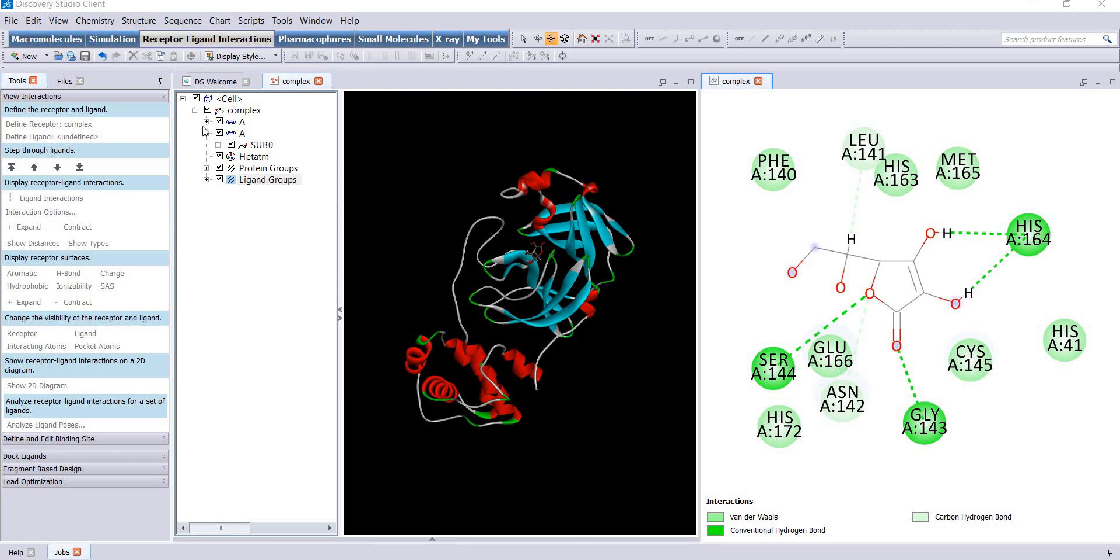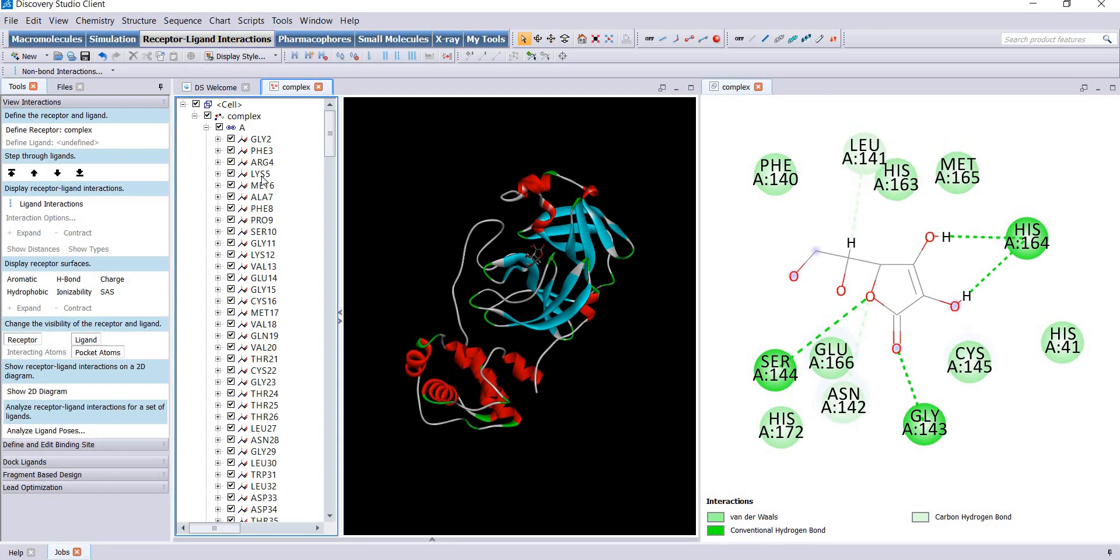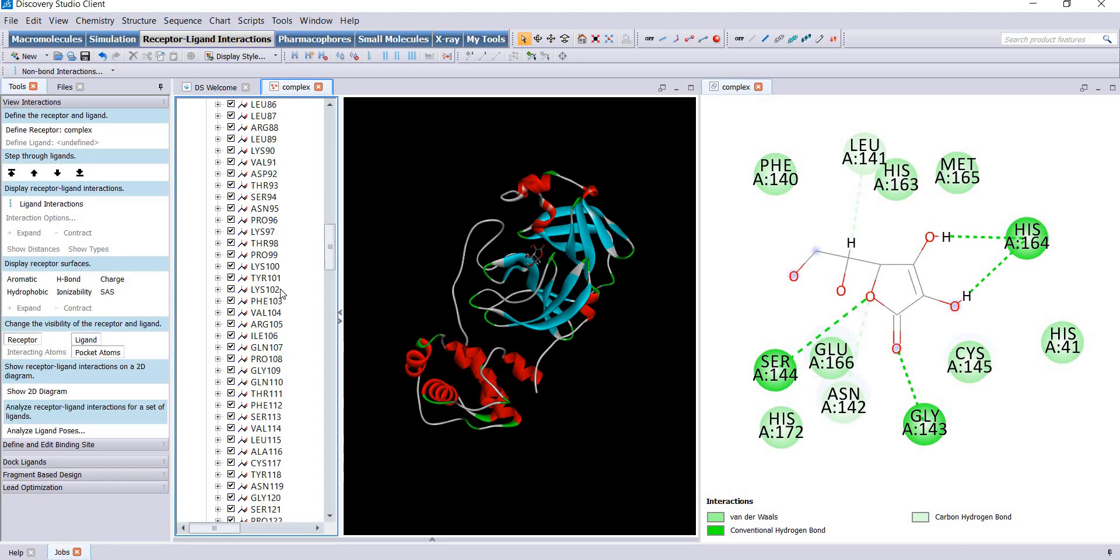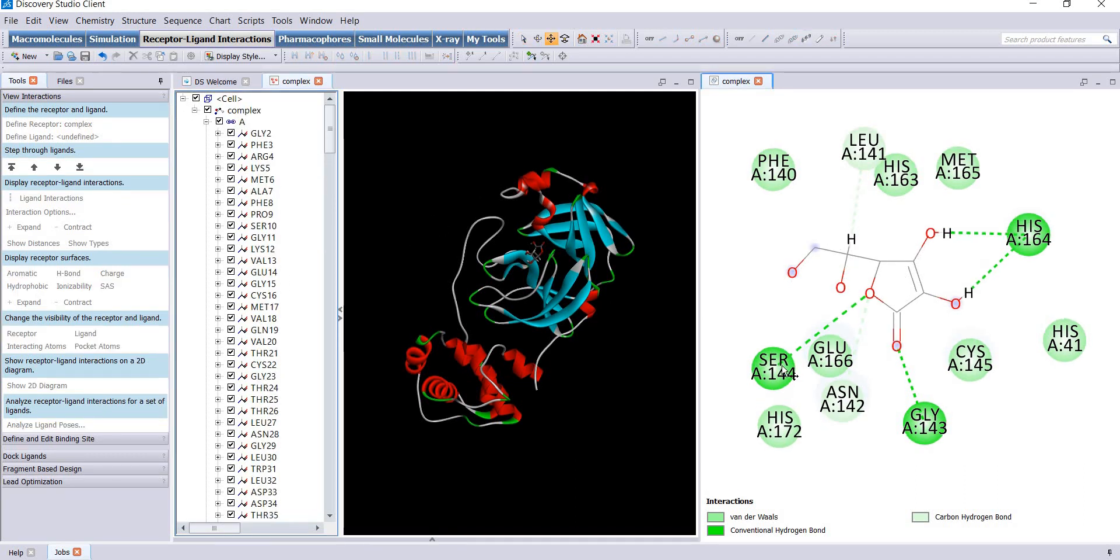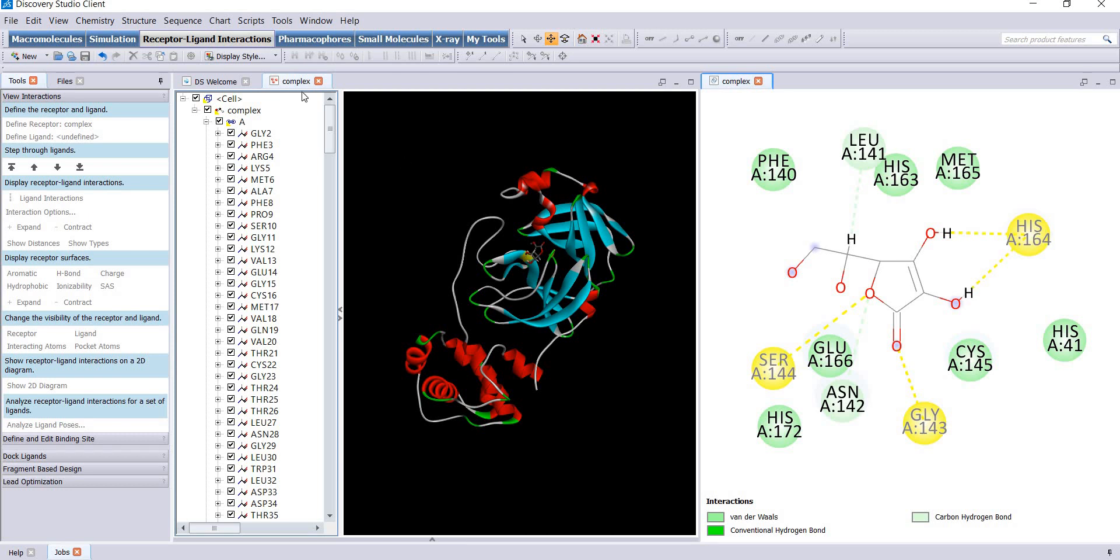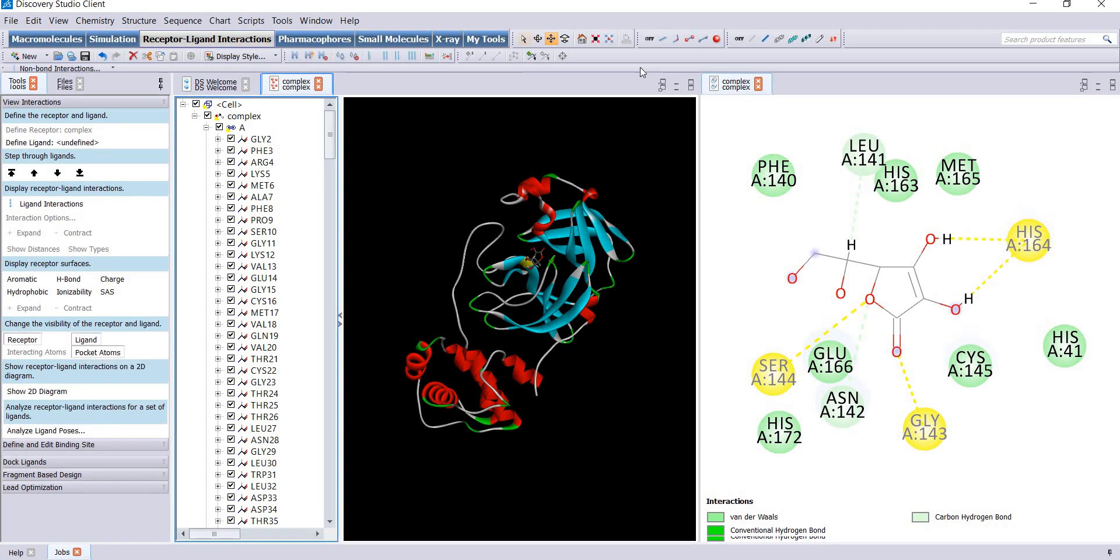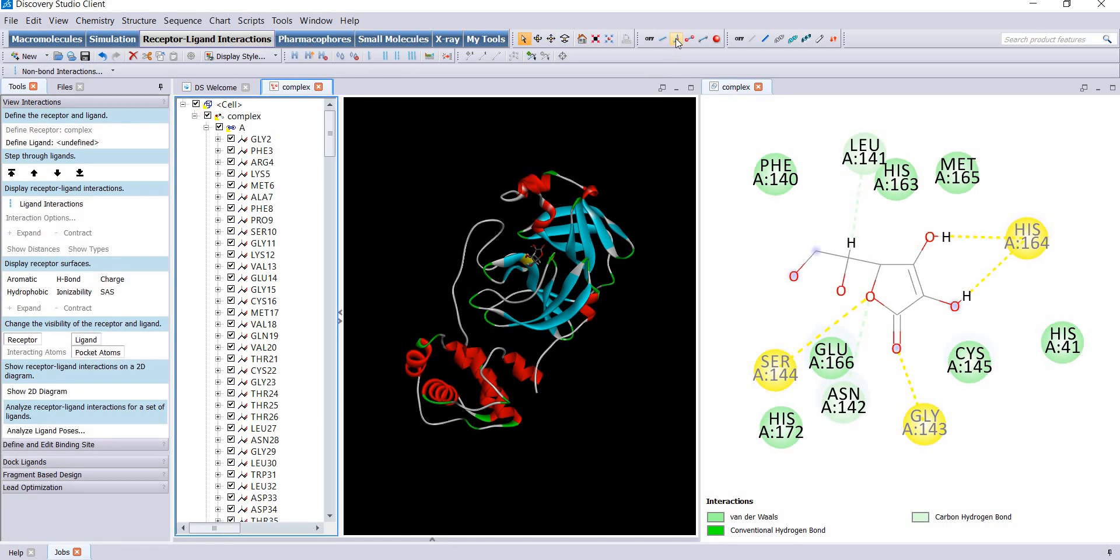You can select this image, press shift along with click and select, and activate this window here and expose these residues.